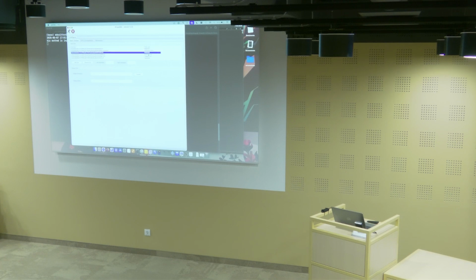This is again restraints. This is my reference data. This is my triggered data. Normally you know which files you're working with, right? So now you have to assume that these are the correct files. We can give it an output directory, so we can say run 1. We can change the resolution, we can change the output prefix, but again, we're going to keep things default to keep it simple.